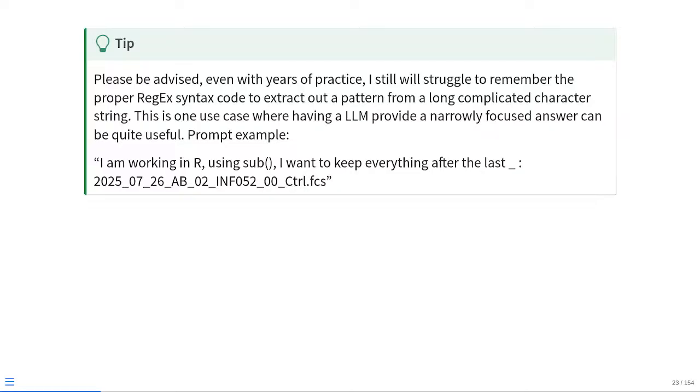However, one thing that's very useful is if you think of a large language model like ChatGPT or Claude, if you ask it a very narrow question and you are asking for something very specific, it's really good at quickly coming up with the actual regular expression that you need to do the substitution that you're trying to do.